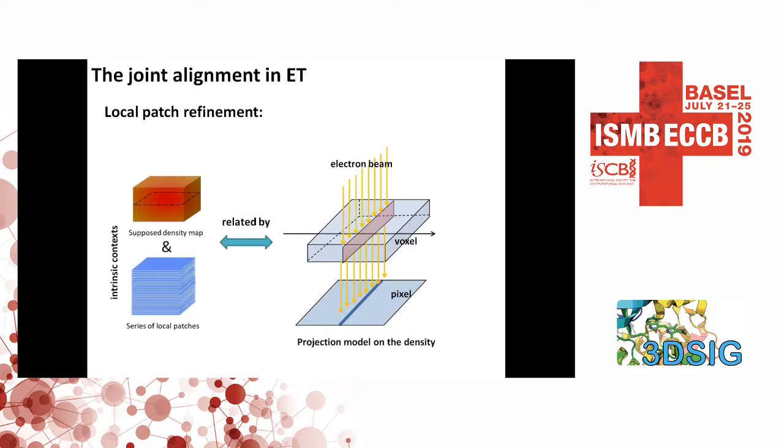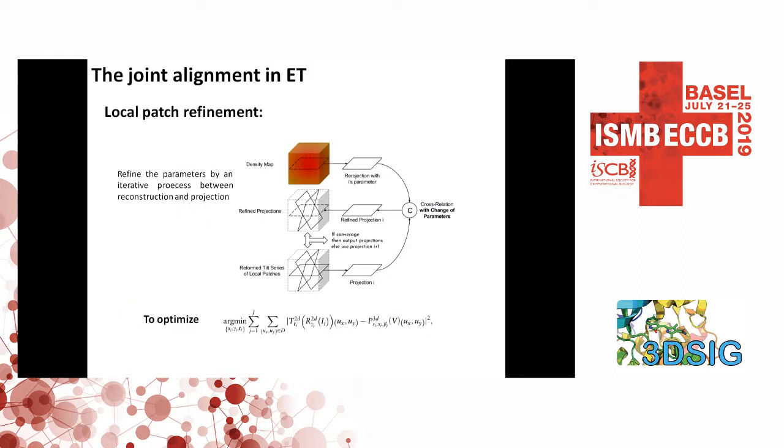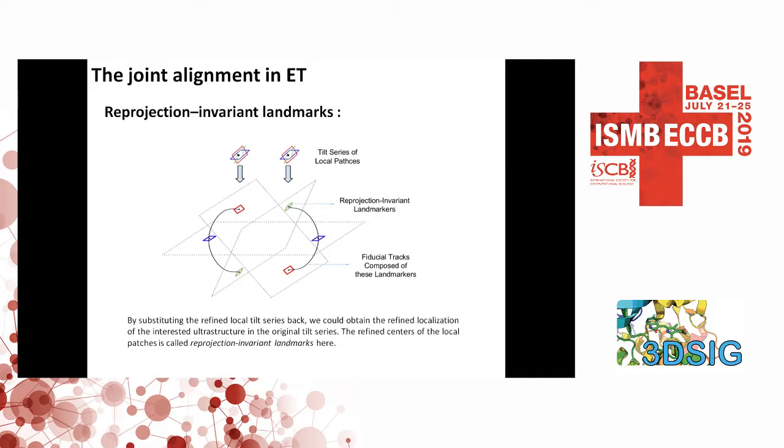We should find that a pixel on the projection is an integral of the voxels in the samples. So we try to solve such reconstruction and reprojection problems. Our goal is to optimize the supposed samples and their reprojections and what we observed, and minimize their difference.